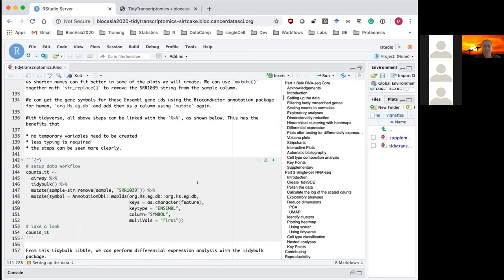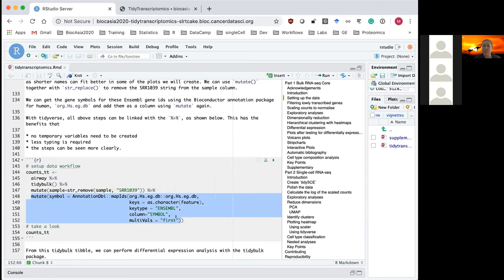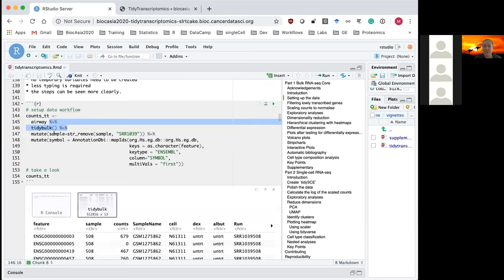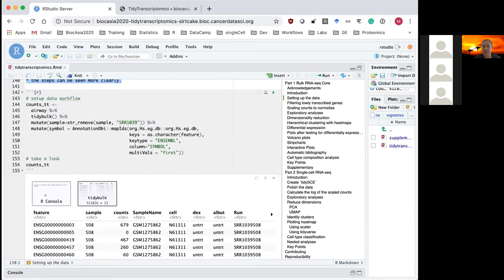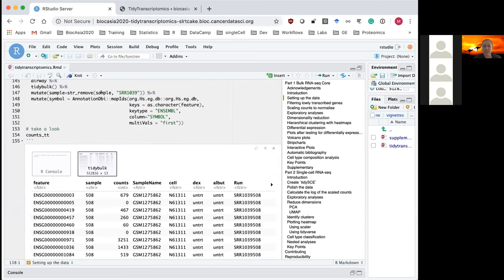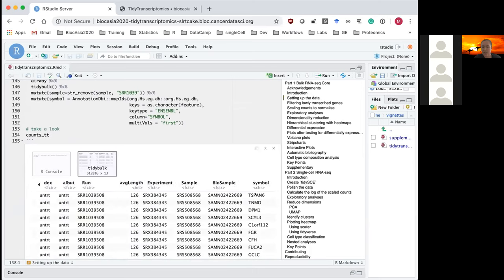Next, I'll do some preprocessing of the data: shortening the sample IDs using the tidyverse mutate function, and adding gene symbols using mutate with a Bioconductor annotation package. Throughout this workshop we use the tidyverse pipe to chain together different functions and commands. This is good practice because it means we create fewer temporary variables, type less, and can see the steps more clearly.